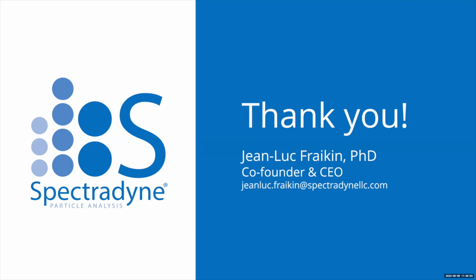Most people haven't had a problem with Tween. It really depends on the composition of the LNPs you're making. If you're having issues, I would recommend getting in touch with us. We've gone to default on a lot of these samples now using poloxamer 188 instead of Tween, because it's much more gentle and doesn't cause any lysing or anything of that sort.